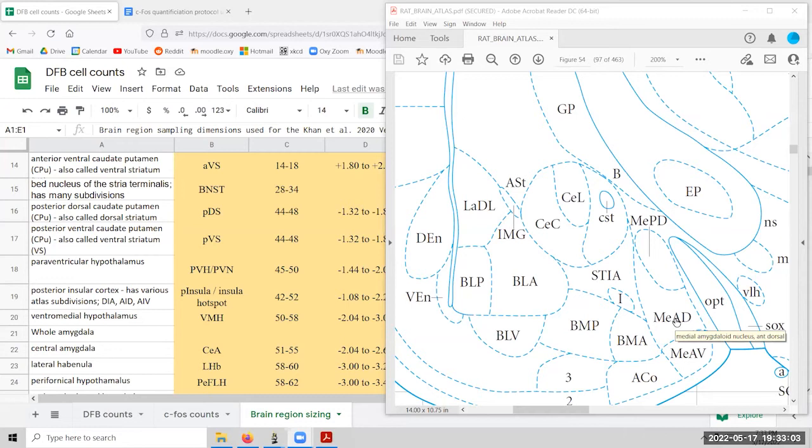We've got medial amygdala down here. We've got basal medial amygdala here. And then we've got basolateral amygdala still down over here. So it's taking up all this wide region. The only things that aren't part of it are a few other little regions here and there. That would include things like probably the AST, yeah, amygdalostriatal transition area. It's a little bit unclear. Intercalated nucleus of the amygdala. These are, again, very minor regions that we're not really going to focus on for our purposes in this counting project. So we're going to try to focus on as much as we can in the picture.